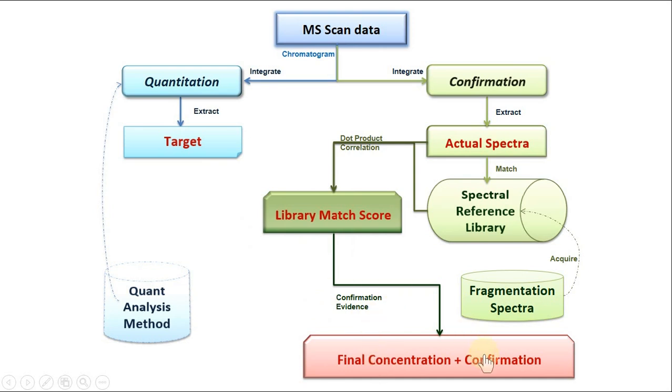More ions are typically involved in the spectra than just the target and qualifiers in quantitation.